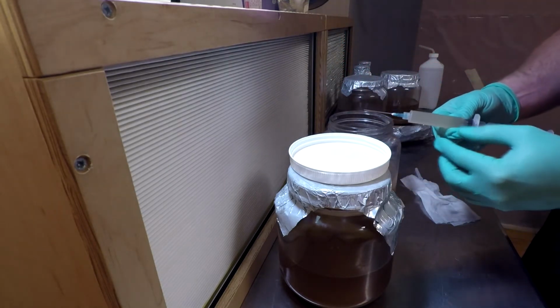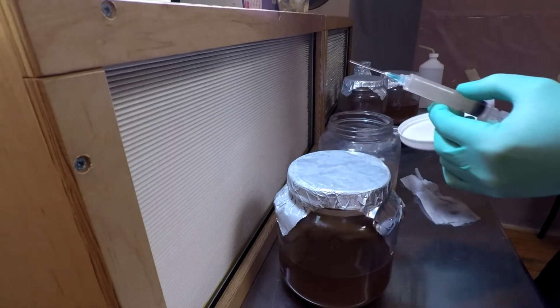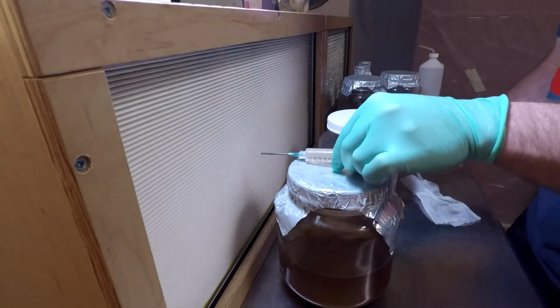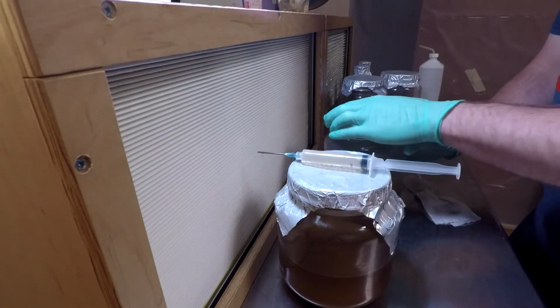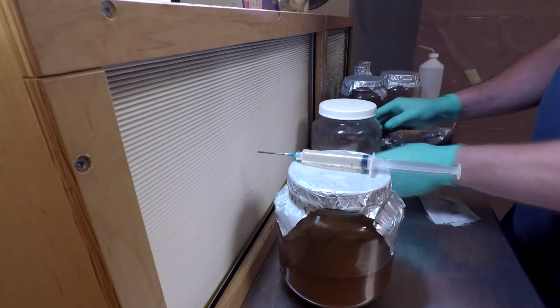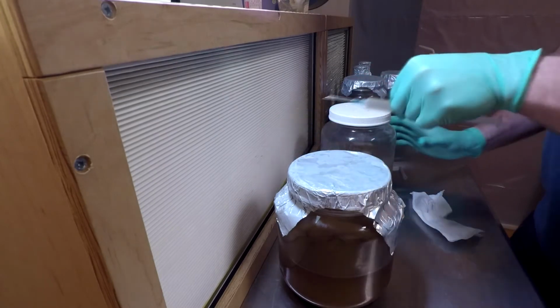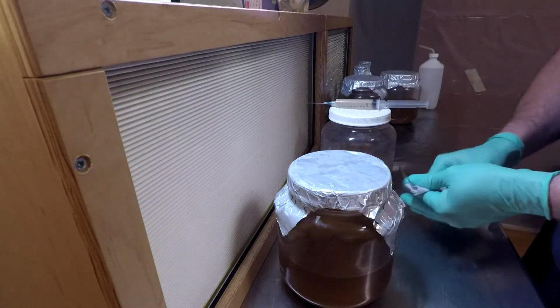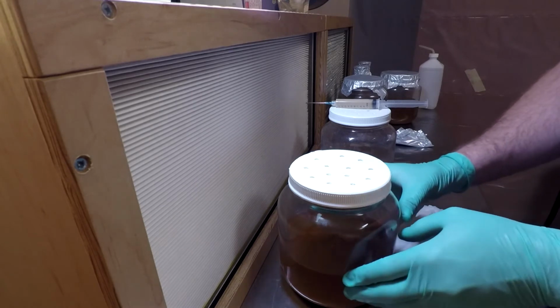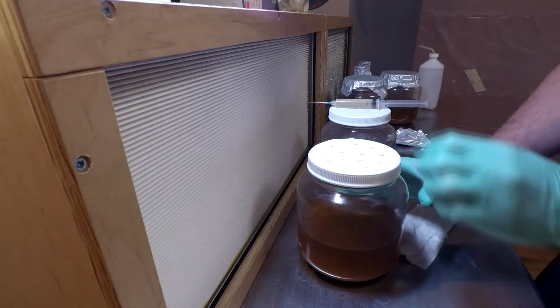You can see I just sucked some of the liquid culture up. I'm going to go ahead and re-lid this because I'll be using some of this jar to inoculate grain bags as well. Now I'll hold the syringe, and then I'll just put 2 cc's into the half gallon jars and 1 cc into the 500 milliliter glass. And that'll be enough to spread it out.